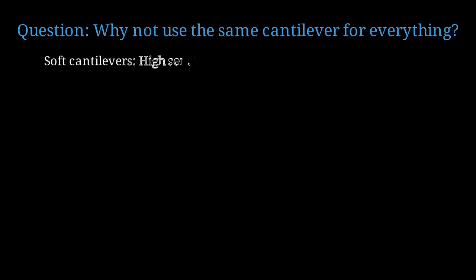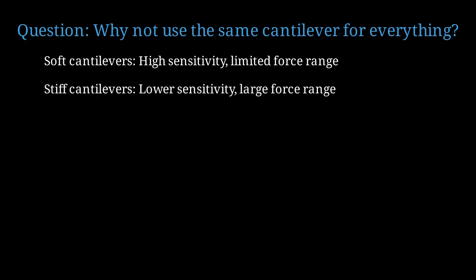You might ask, why not just use the same cantilever for all experiments? The answer relates to sensitivity and force range. Soft cantilevers with low k values give you high deflection sensitivity. A small force produces a large, easily measured deflection, but they have a limited force range before they bottom out. Stiff cantilevers can handle large forces without excessive deflection, but they're less sensitive to small forces. You need to match your cantilever to your sample.